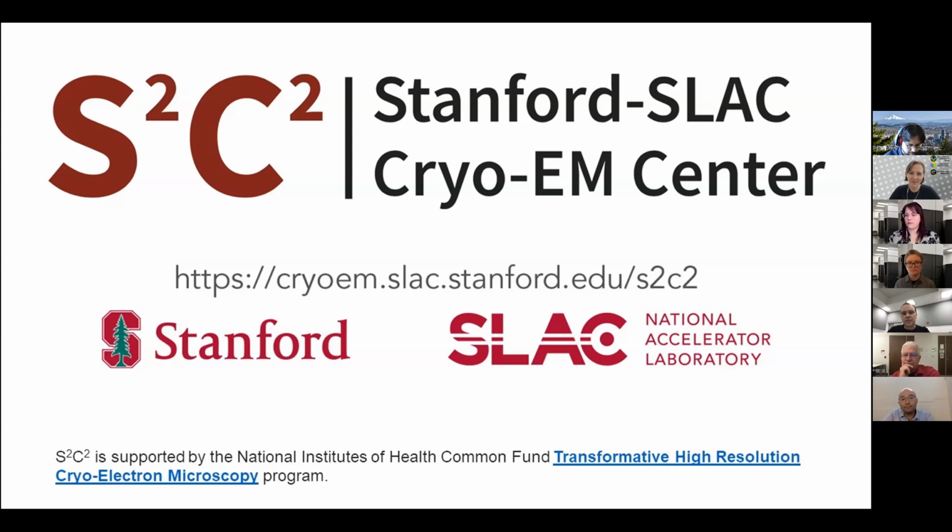We are currently taking applications for data collection as well as in-residence training. Much like the other centers, we currently aren't allowed to have people on site. So our in-residence training will be remote initially and then move back to on-site training once that's allowed.